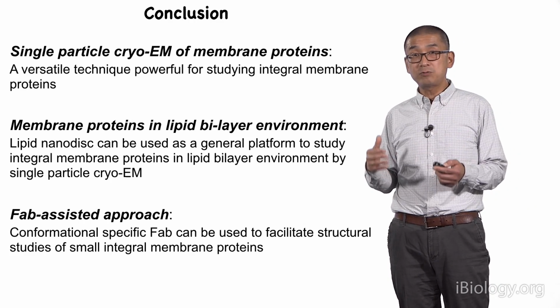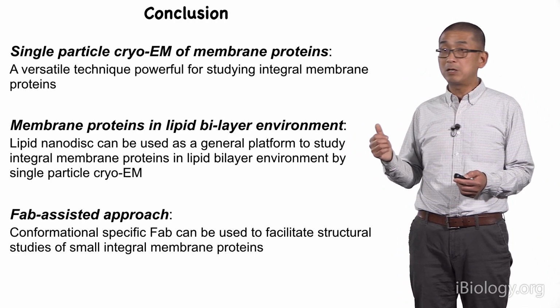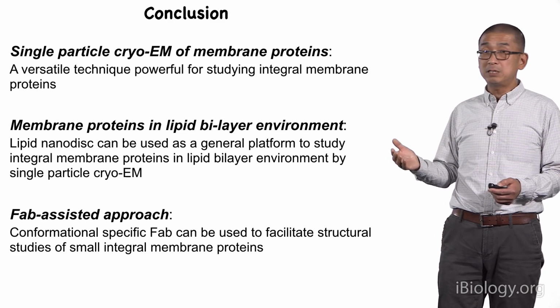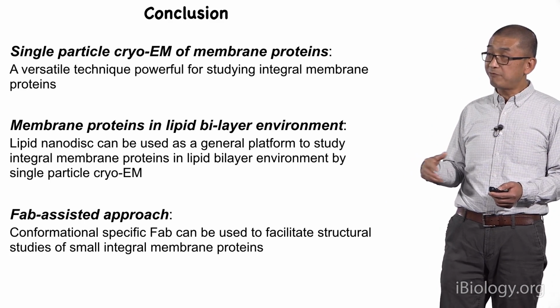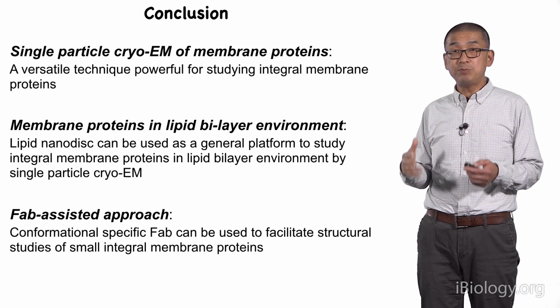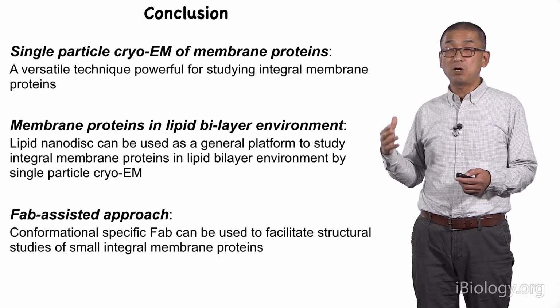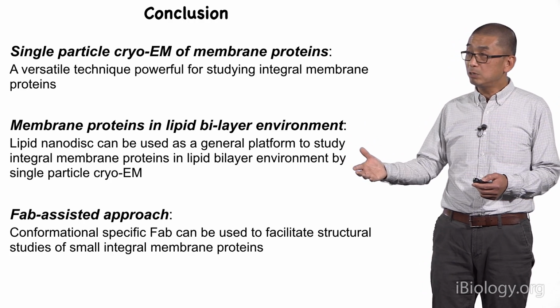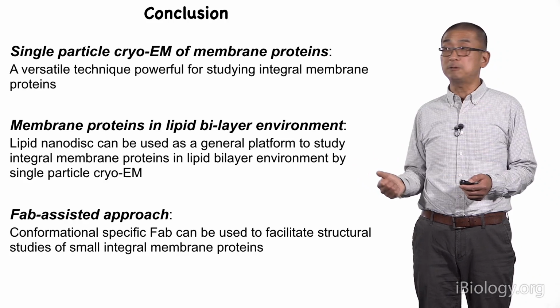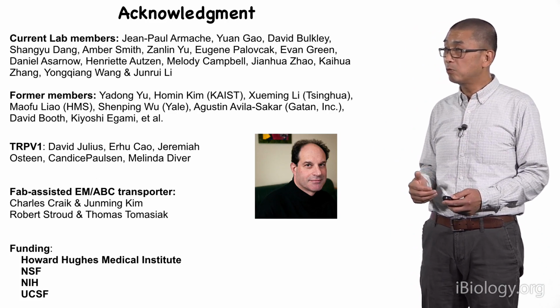And also specifically to visualize the membrane lipid interactions, which may be better preserved in the presence of a lipid environment. And lastly, we also showed that using the Fab approach, we were most likely able to study membrane proteins with very small or even no soluble domain. We hope that using Fab could be another general approach that enables us to study such membrane proteins.